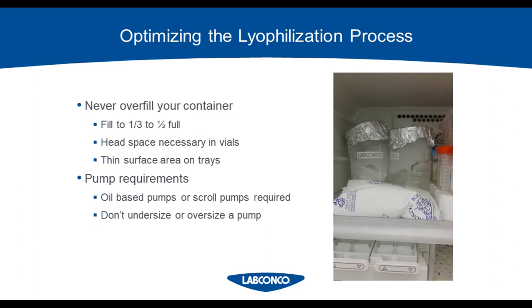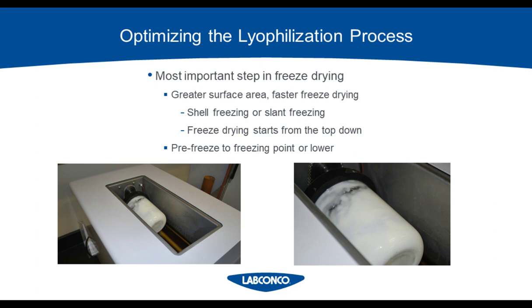You want to consider your pump requirements. If you don't want to do a lot of maintenance, a dry or scroll pump would be your best option. You do need to make sure that you have a specific minimum requirement for your pump in order for it to do freeze-dry work. Never oversize or undersize your vacuum pump.